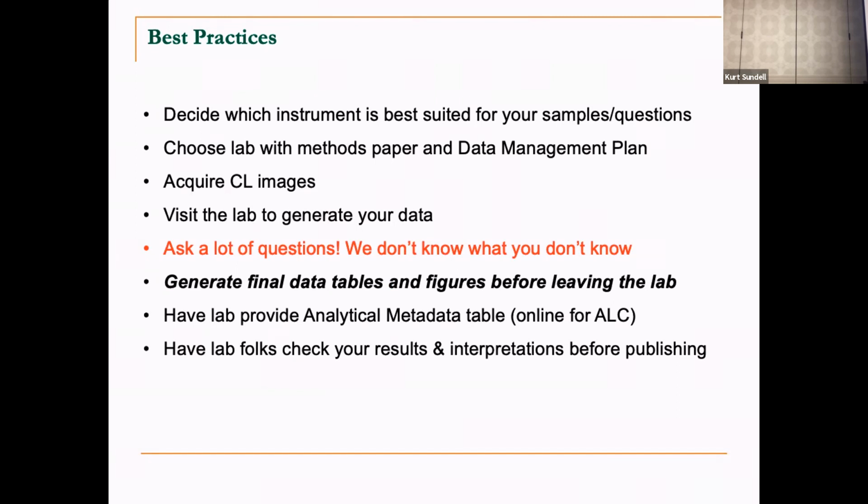Take CL images if you can. These things are so informative. Come to the lab. We love to see you guys. We love to have visitors in-house. It's been really hard with COVID not being able to do that. But we'd like to work with you on these things. We don't really want to do the work for you and then just send it to you because that's not going to benefit anyone.